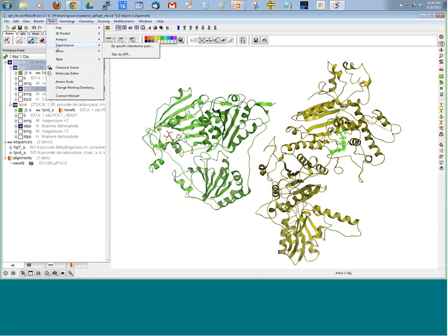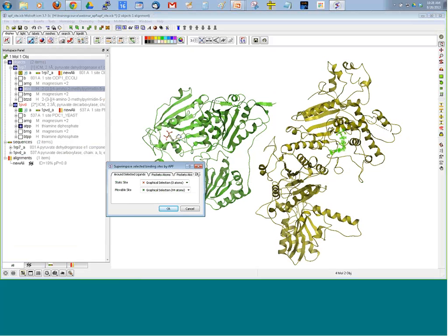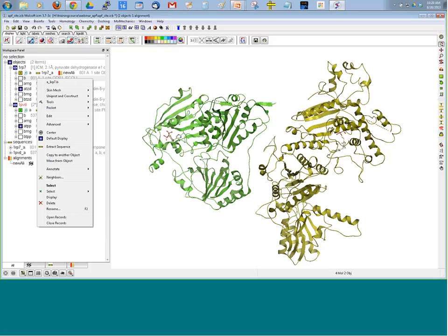And so we choose which protein is going to be the static one. So just for clarity, we'll also delete the other subunits, other molecules that we're not interested in. So all we really need is the receptor and the ligand. So the other molecules we can discard.